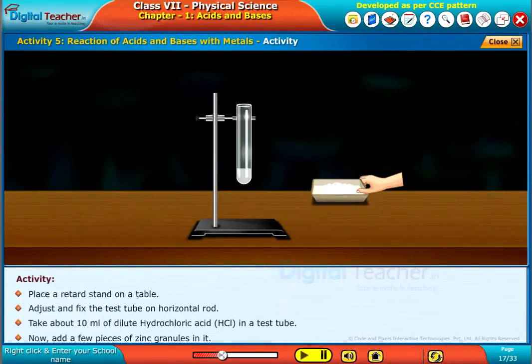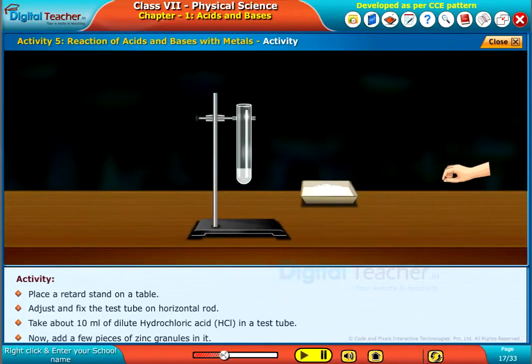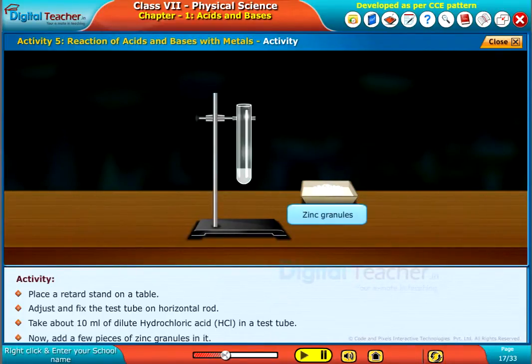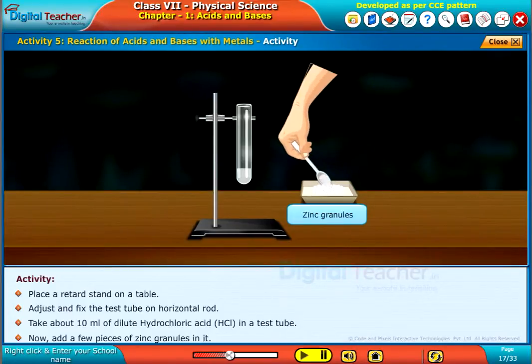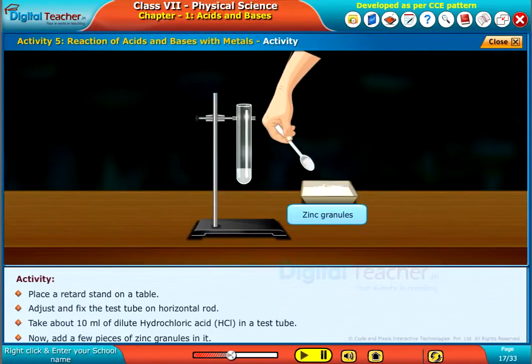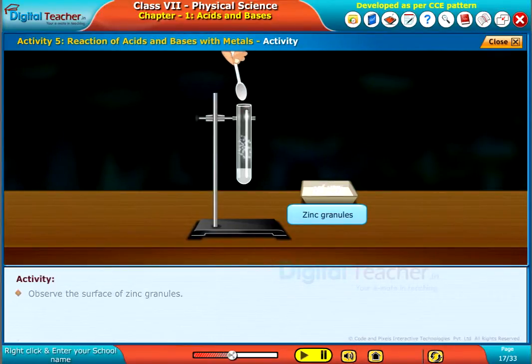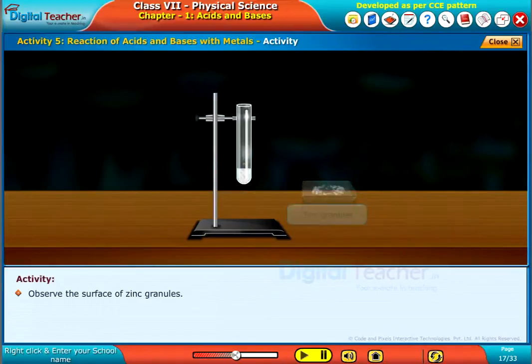Now add a few pieces of zinc granules in it. Observe the surface of the zinc granules.